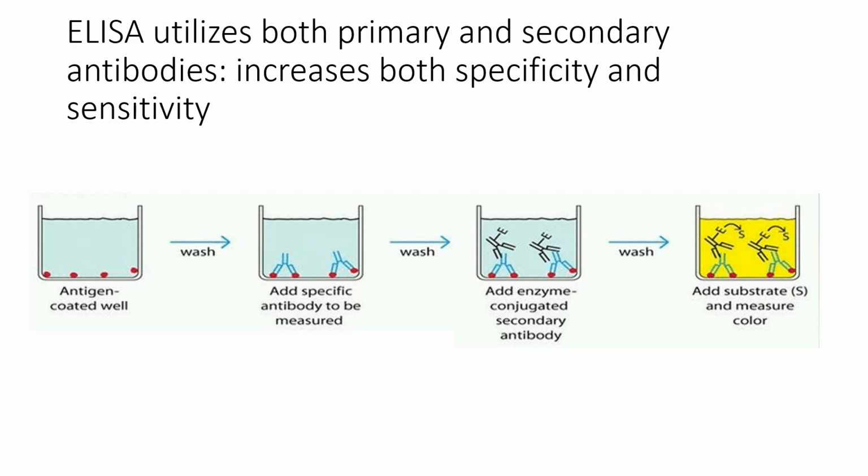You don't need to have any science background to do an ELISA, because it's really taking somebody's sample, urine, blood, could be stool, and going through a series of adding solutions, primary, wash steps, secondary, wash steps, and then a substrate, and boom, you've got a color.